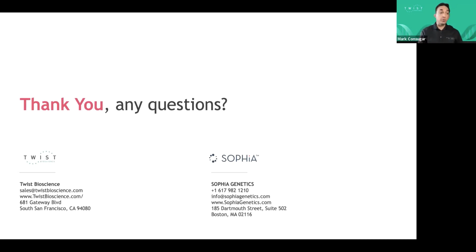And then what I like doing is I like taking and putting a probe that's absolutely known to be associated with a non-breakpoint region, and then also on the inside of the founder gene as well. You can do it on the opposite side as well. But here's the thing. If you highly tile the probes, you allow the inversion breakpoint to be walked or expand or contract. At the same time, what I would also say to someone, if you're really looking for inversions like that, generate fragments that are larger.